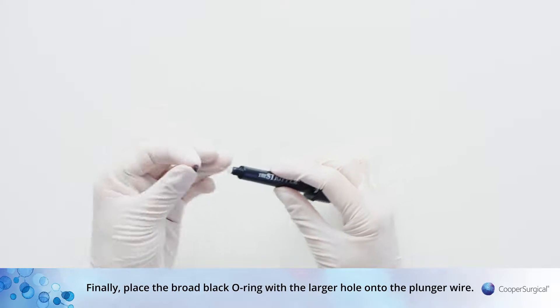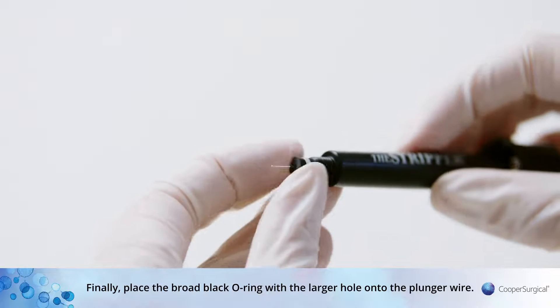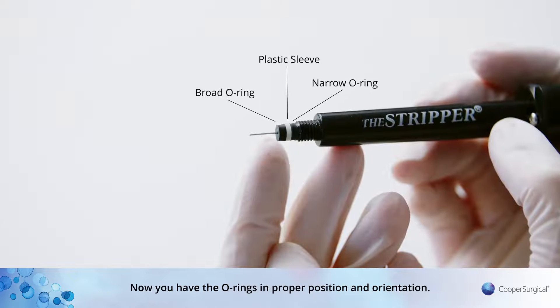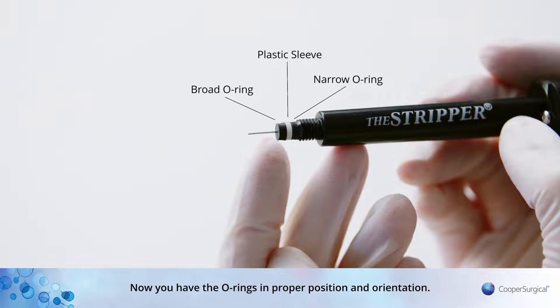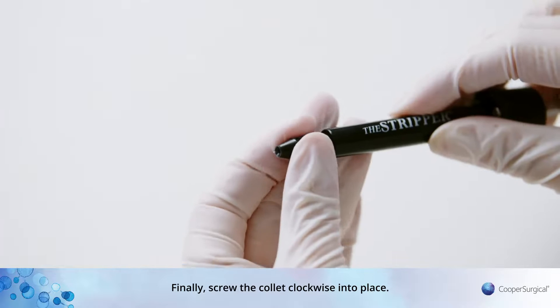Finally, place the broad black O-ring with the larger hole onto the plunger wire. Now you have the O-rings in proper position and orientation. Screw the collet clockwise into place.